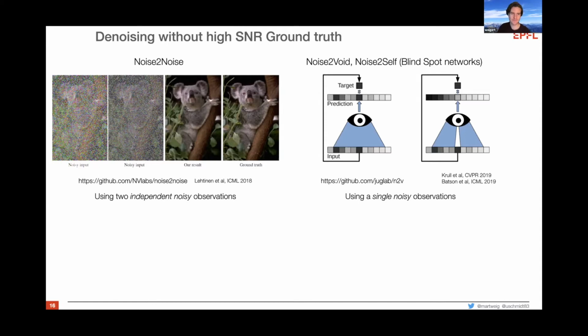Right? I mean, the method you're describing, where you're doing a high resolution of a fixed sample, comparing it to a live sample, is, to my mind, a bit dangerous, because that fixing will create all kinds of artifacts, both in shape and in fluorescence distributions.